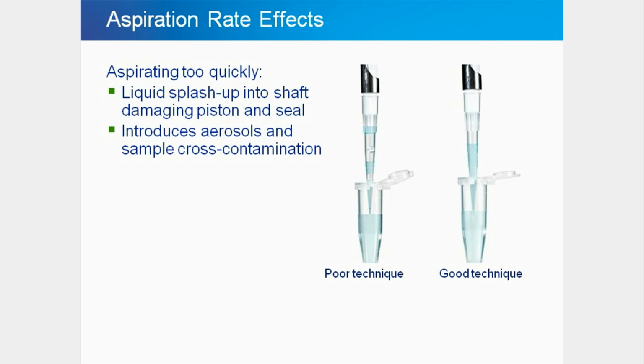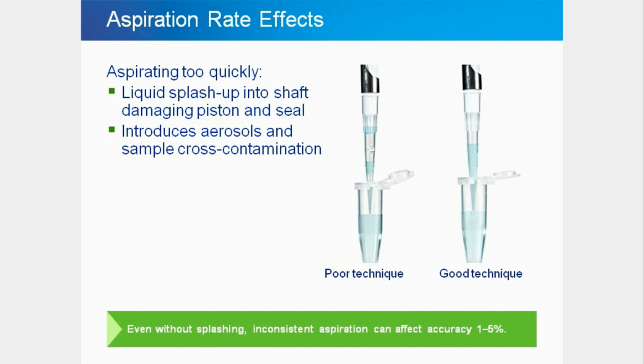Maintaining consistency in your pipetting technique is important to achieve high accuracy. Rainin recommends that you use a consistent pipetting rhythm from sample to sample. For example, when using a macro volume pipette, 1 milliliter or greater, it is important to pause after sample pickup and allow the sample to fully aspirate before removing the tip from the liquid. A minimum of 1 second of tip immersion time is recommended. Releasing the pipette plunger button too rapidly can cause several technique-related problems, such as fountaining, sample splash, or bubbles.